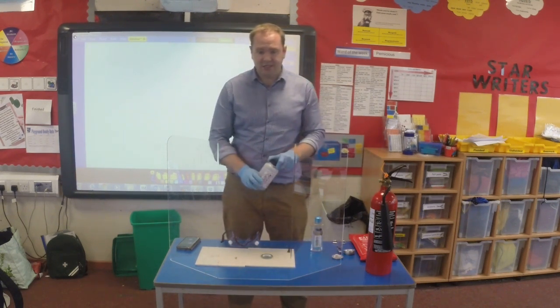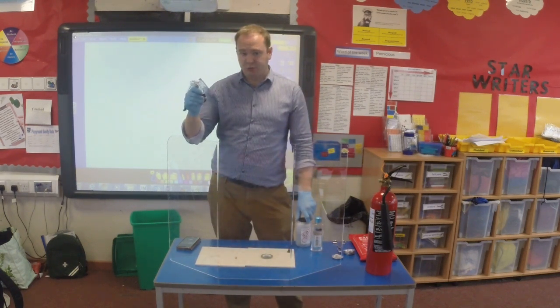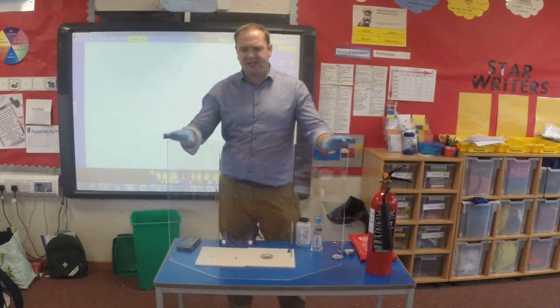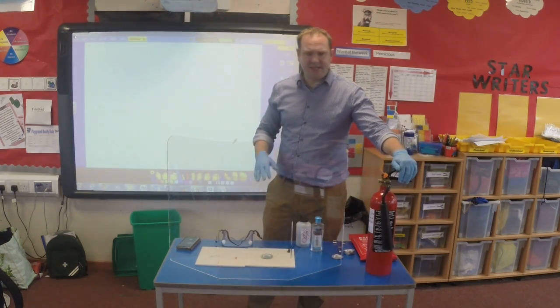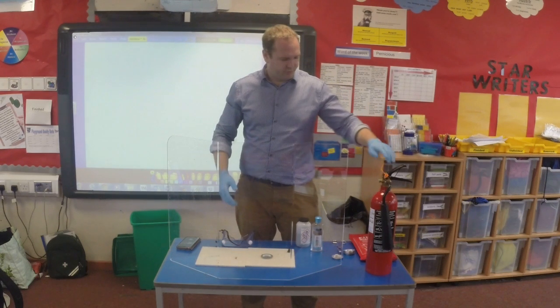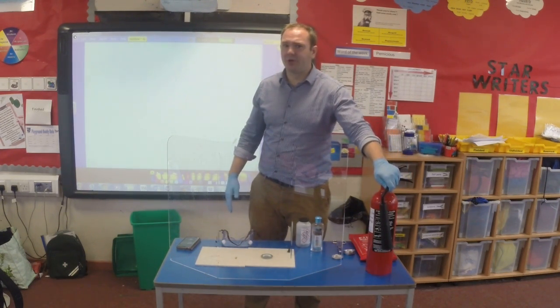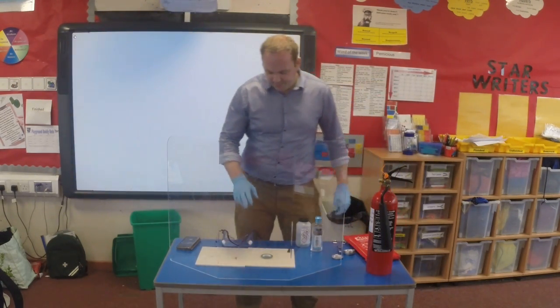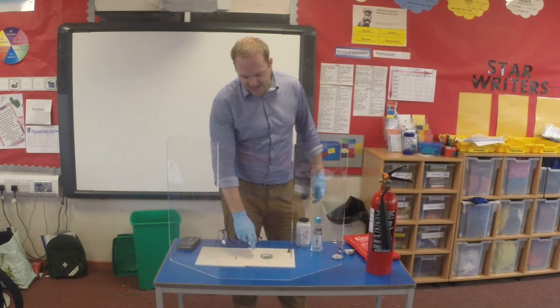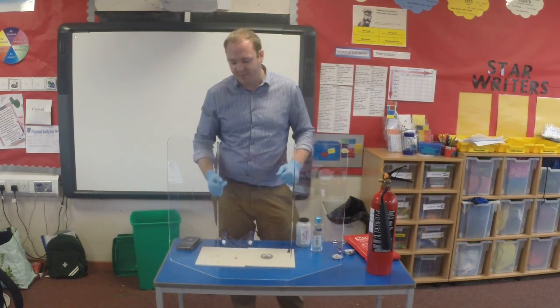In terms of safety, you should be wearing safety goggles whenever you're performing this. A blast screen to protect your class is highly recommended, and because it is an oxidative or fiery reaction, it's a good idea to have a fire extinguisher on standby as well, and possibly even a fire blanket. Essential is a ceramic or any sort of heat-proof mat as well.